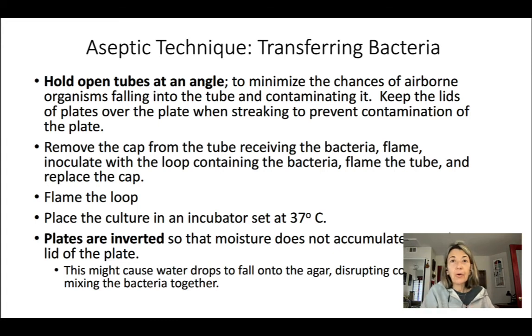Okay, so again, watch the video. It's going to make much more sense. And now you can start your culture. Now, what I just showed was about a tube, which you could be inoculating, let's say, a broth or a deep. If it was a plate, I can do additional things to it, and this is something we are going to see in further units. So you can do what is called a spread plate or a streak plate.